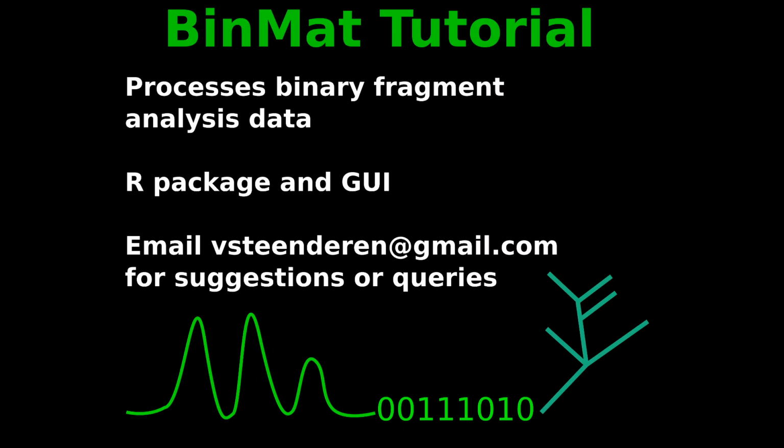Welcome to part 1 of 2 of a tutorial video series on how to use the BinMat R package. So this package was created to help the user process binary data that has been scored and binned from fragment analysis genetic methods such as ISSRs or AFLPs.